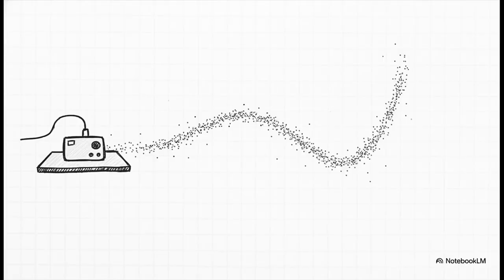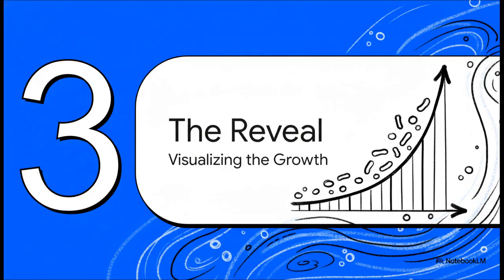You come back and the data logger has collected thousands of data points. And when you plot that data on a graph, this clear, beautiful pattern emerges. It's a story as old as life itself. And now for the payoff. All that prep, all that waiting, it all comes down to this one powerful image, the growth curve.